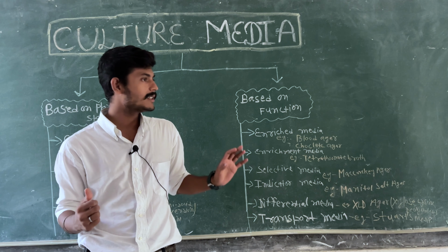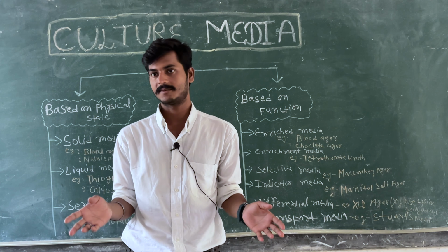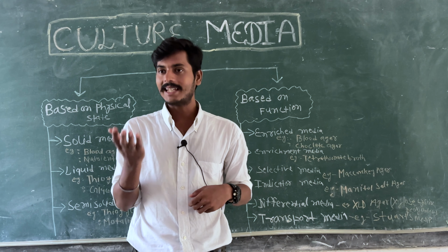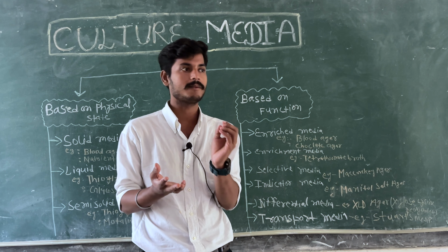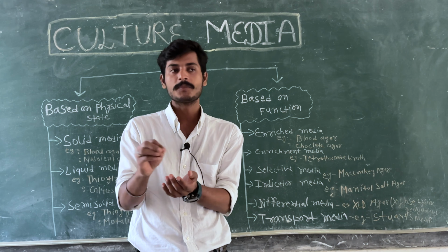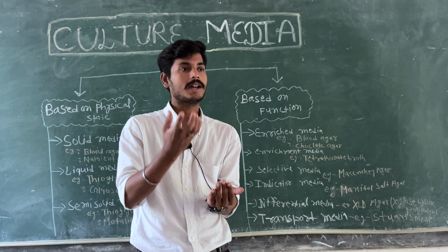Now in today's class we will discuss how, naturally, bacteria are present in the bodies of different organisms or in dead decaying substances. If it is present in the human body, then we have to take samples from the human body, and in that sample a very small amount of bacteria will be present. But in order to see those microorganisms, to establish any significant diagnosis, or to label the bacteria, we need a proper description of the bacteria. So for proper description, we have to grow them in a larger amount.